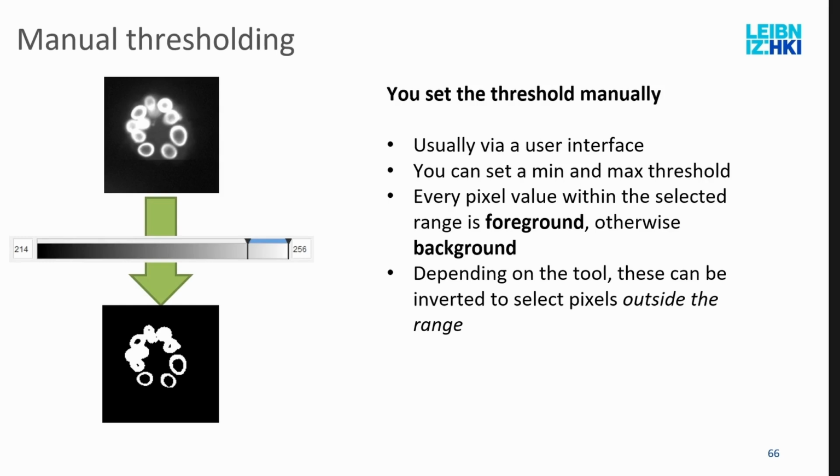In ImageJ, it's very convenient, where you can preview everything. In JIPipe, you can also do this, and then you type in the thresholds manually, the values specifically, and then you just come up with a range that works well for you. Then you can say, everything below this value is discarded, is seen as background, and everything larger than this value here is seen as foreground.